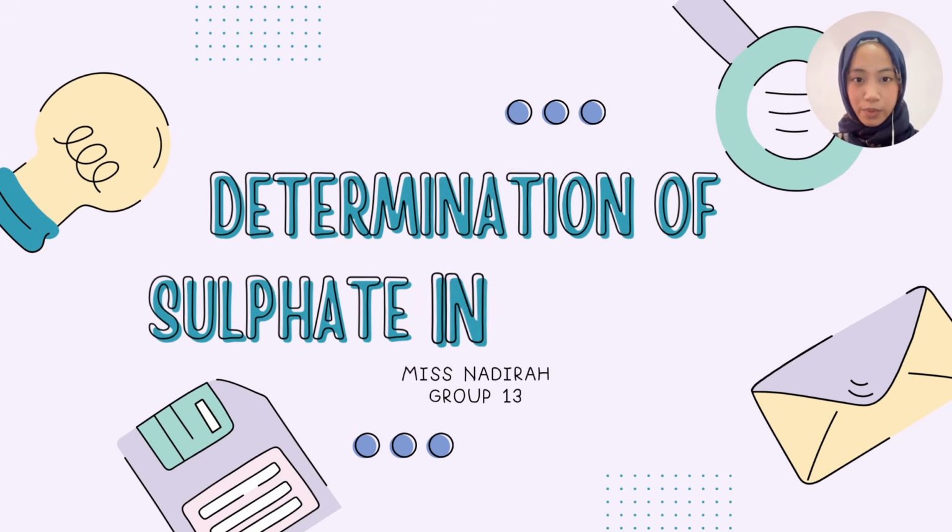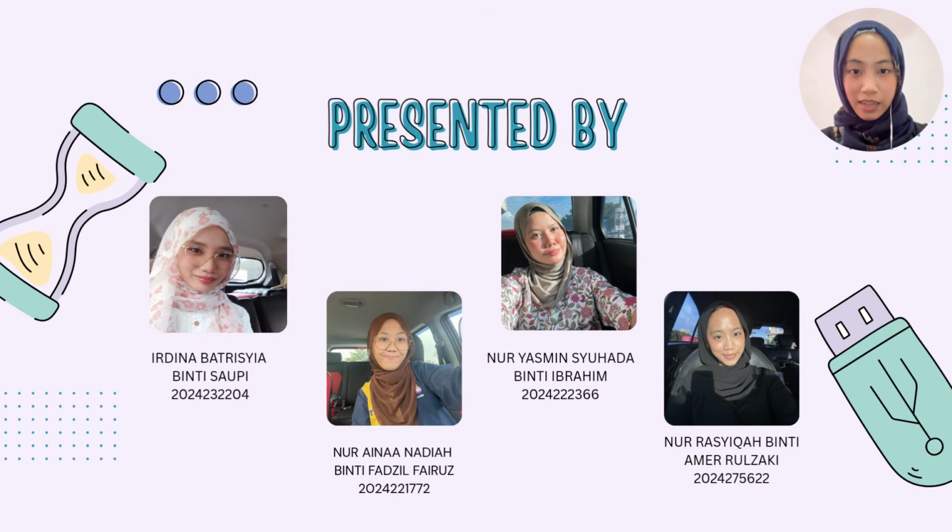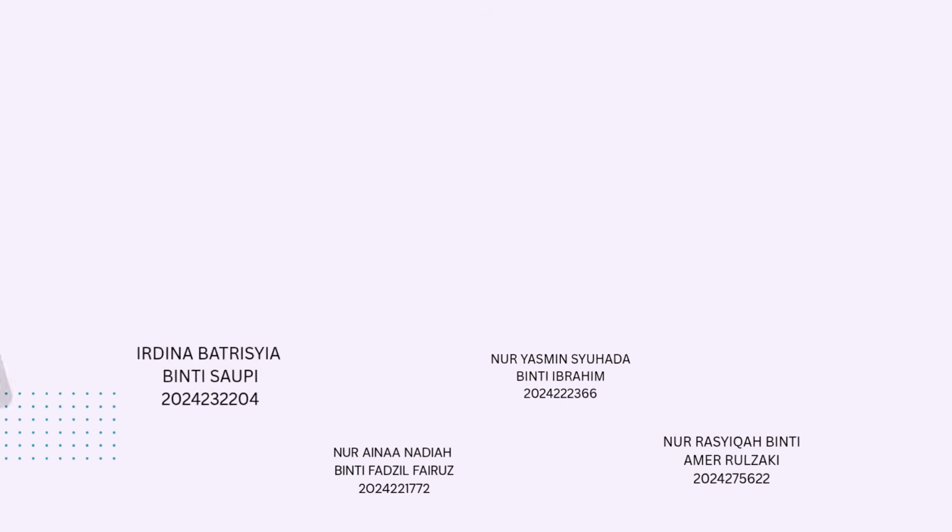Today, we are going to explain the determination of sulfate in fertilizer. This will be presented by Irdina, Aina, Yasmin and Rashika.